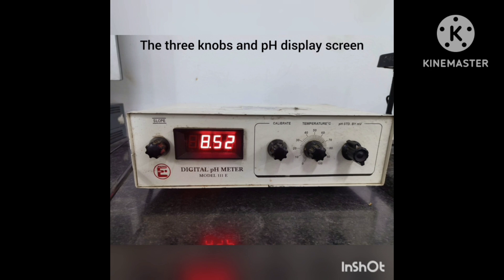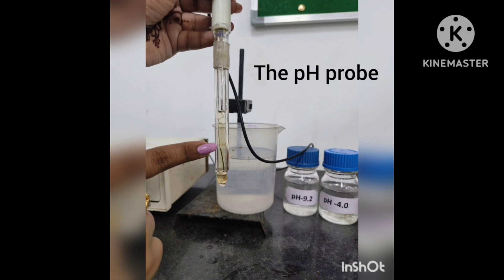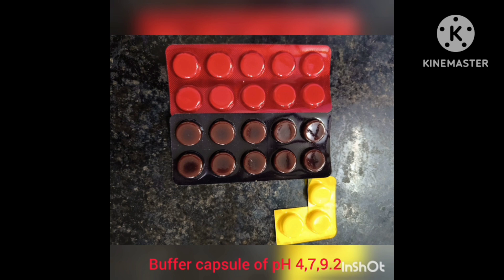A pH meter is essentially a voltmeter with high input impedance which measures the voltage of an electrode sensitive to the hydrogen ion concentration relative to another electrode which exhibits a constant voltage.